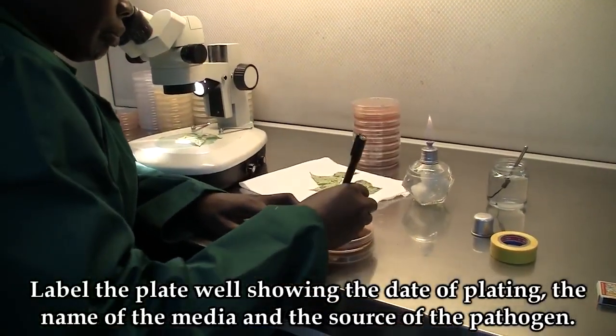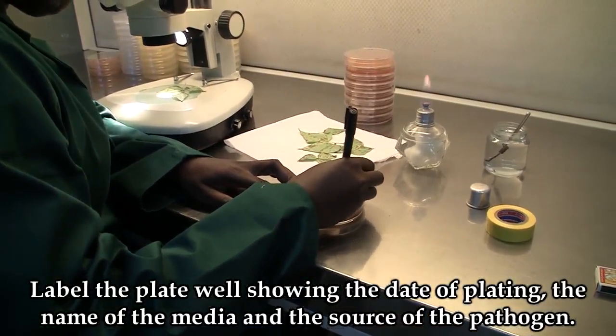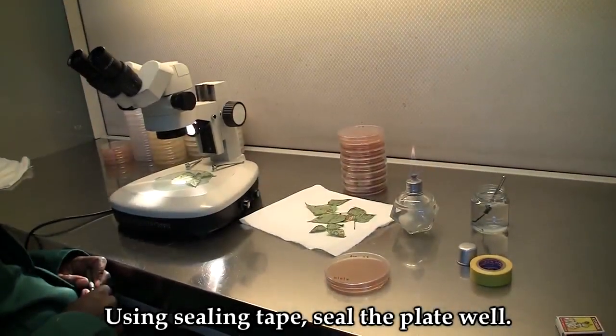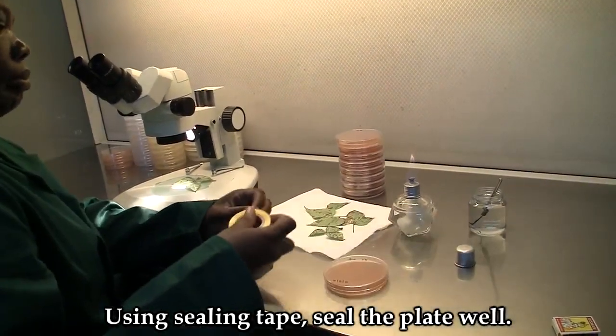Label the plate well, showing the date of plating, the name of the media, and the source of the pathogen. Using sealing tape, seal the plate very well.